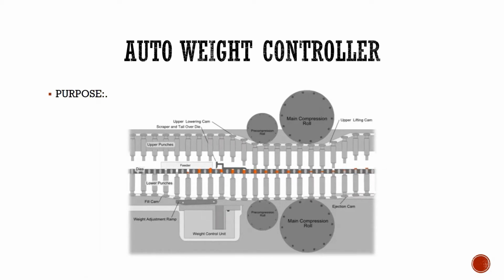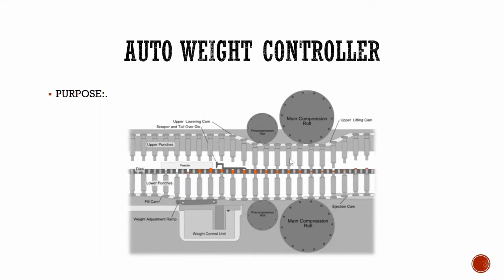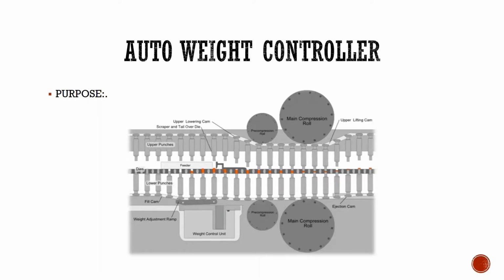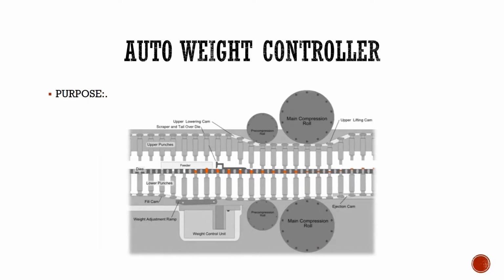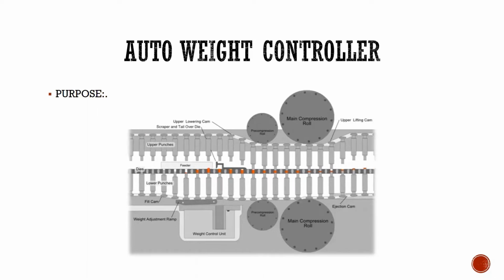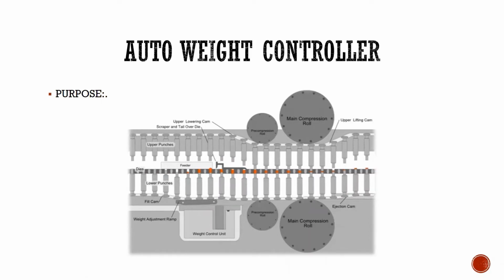A tablet compression machine is a mechanical device that compresses powder into tablets of uniform size and weight. It can be used to manufacture tablets from a wide variety of materials, including pharmaceuticals, nutraceuticals, cleaning products, industrial pellets and cosmetics. To form a tablet, the granulated powder material must be metered into a cavity formed by the two punches and a die, and then the punches must be pressed together with great force to fuse the material together.